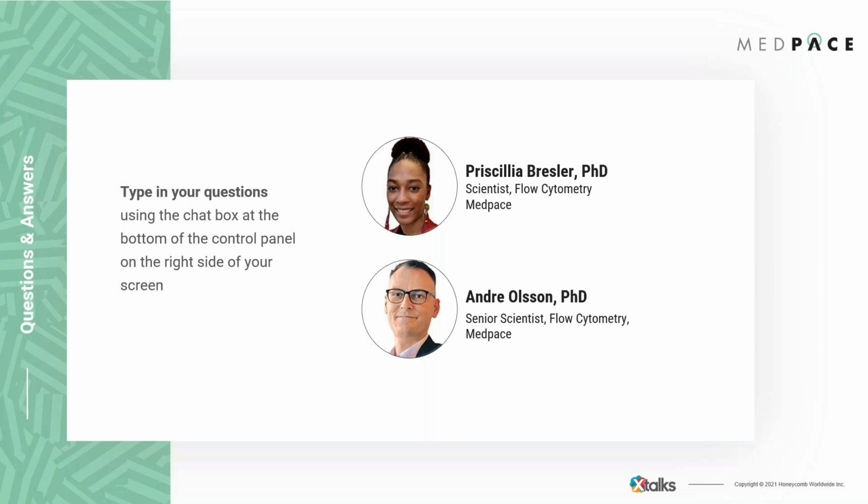So in validation, we look at stability of your specific marker of interest, and we make sure that it maintains the accuracy needed over time. And that's the same for bone marrow, essentially. It's just that bone marrow is a much harder matrix to come by. So with bone marrow, for instance, we might have a limiting amount of cells, so it's not the stability that is the issue. It's the fact that we don't have enough cells from the biopsy to ensure accuracy.